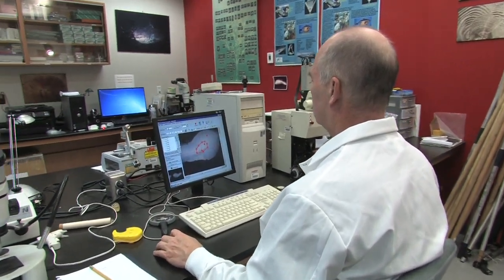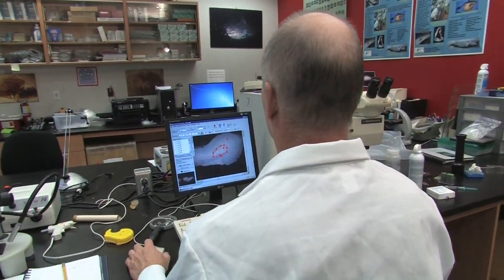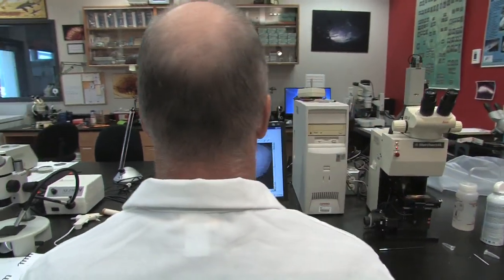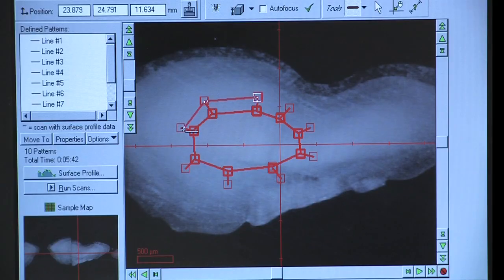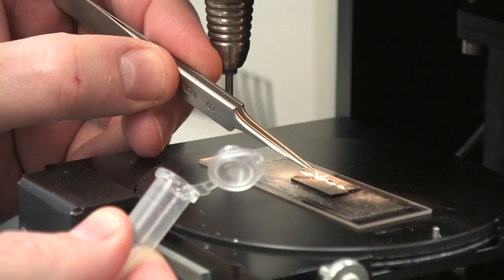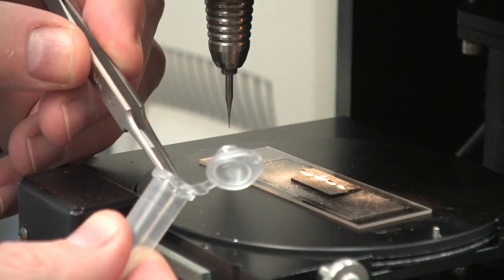This video demonstrates proper setup and use of the micromill milling machine for extracting otolith samples for chemical or isotopic analysis. The micromill is a computer-controlled microsampling device designed for milling materials to recover samples and powder for chemical and isotopic analysis.